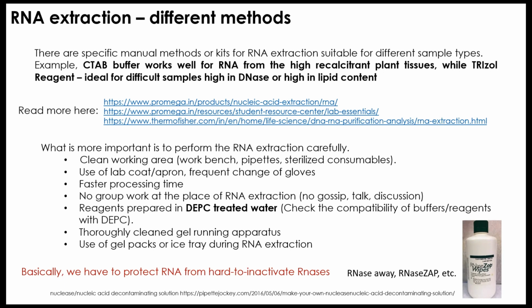And if your buffers or the reagent are compatible with DEPC, you can even make it before autoclaving and then you can autoclave, right? You have to thoroughly clean the gel running apparatus. Sometimes people also use NaOH, a bit of alkaline condition, alkaline water, to clean your trough and the gel trays and comb for the RNA. And it is always advisable to make a separate TAE or TBE buffer, whichever you are using, for the gel loading dye, for the RNA work.